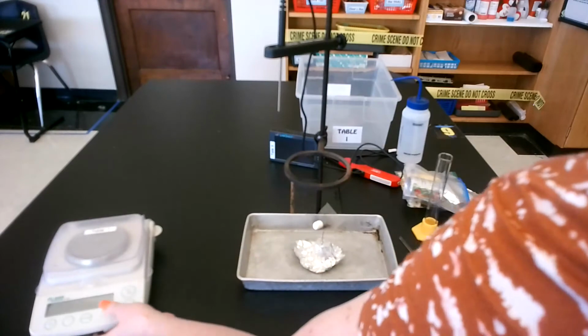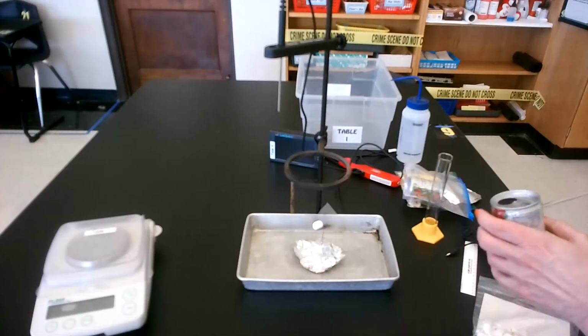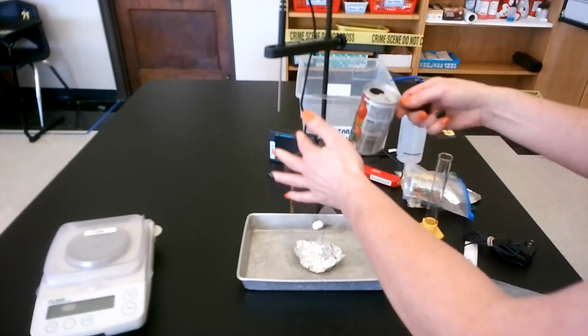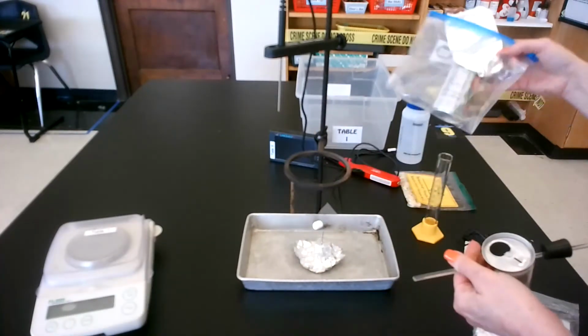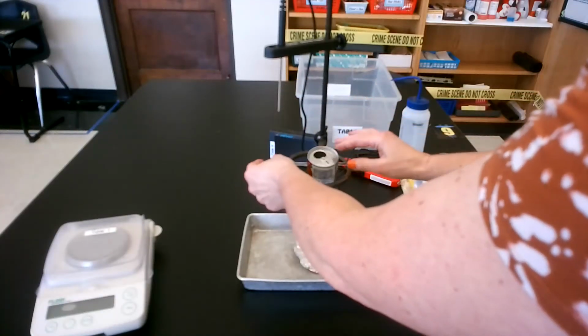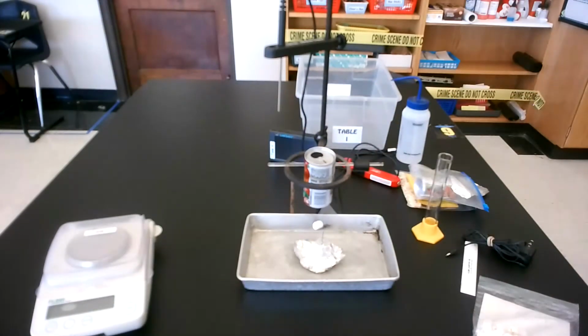Move this aside, reassemble this, and again, don't have someone setting this up when I'm finding the mass of this can and this water. So treat everything separately. So there is that system.